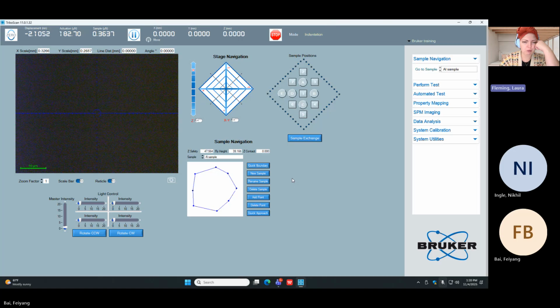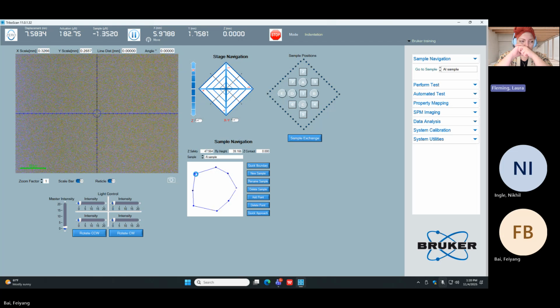Yeah, sure. I think that means we can just right click at the top of this aluminum sample. Perfect. Okay, Kevin is here.